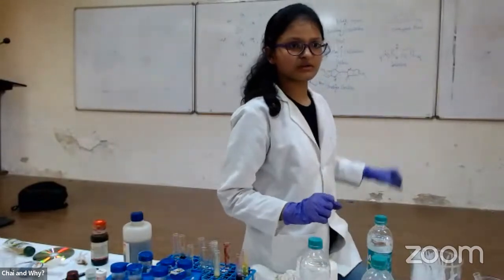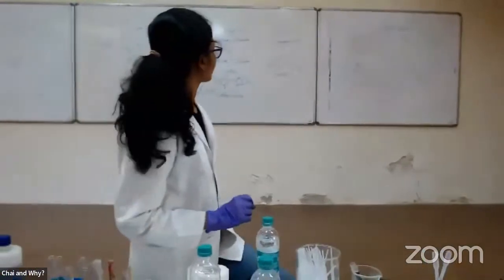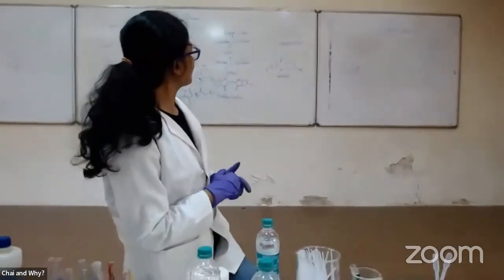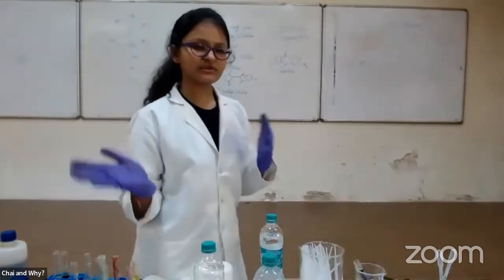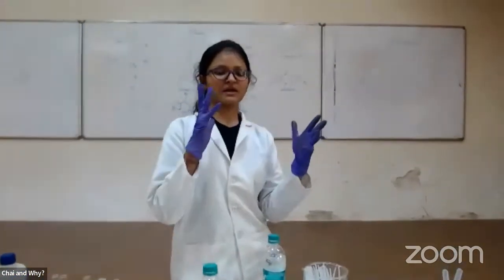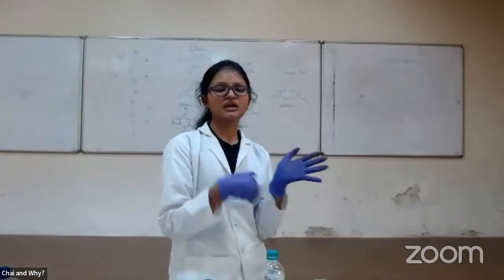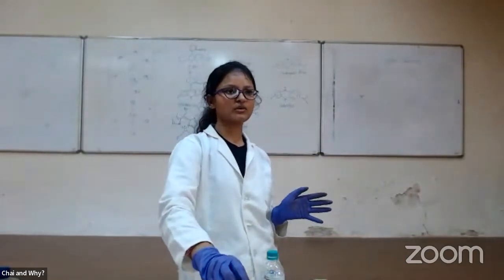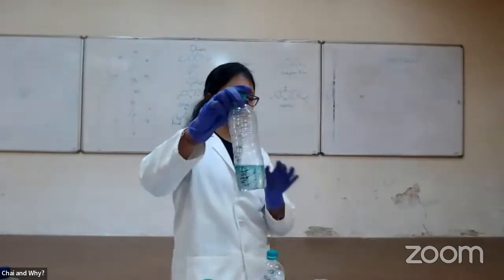Can you focus it? Here is the methylene blue structure. Methylene blue initially did not have a proton. Now, because of the electron transfer happening between the glucose, the reducing agent, and the oxygen, you can see this color change. You'll have to lift it up. Yeah, now you can shake it and see.